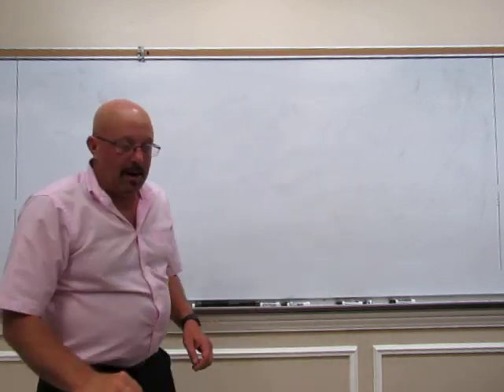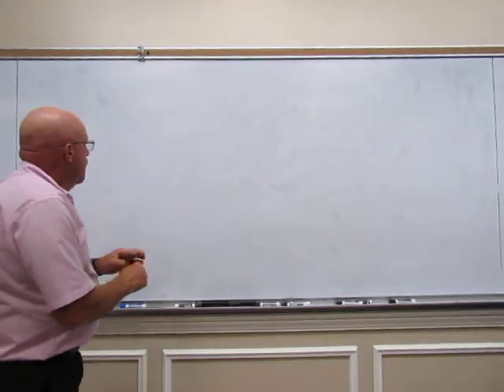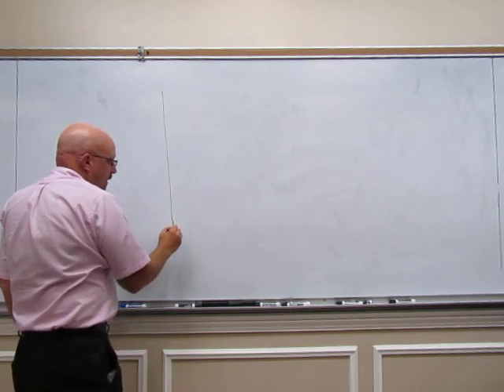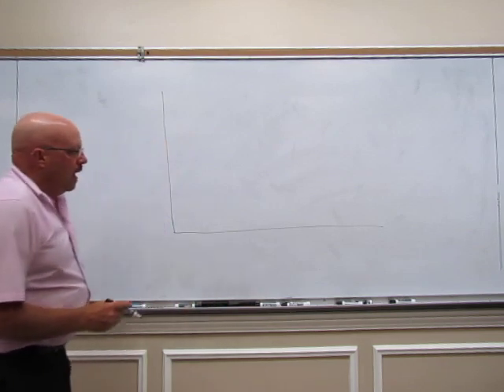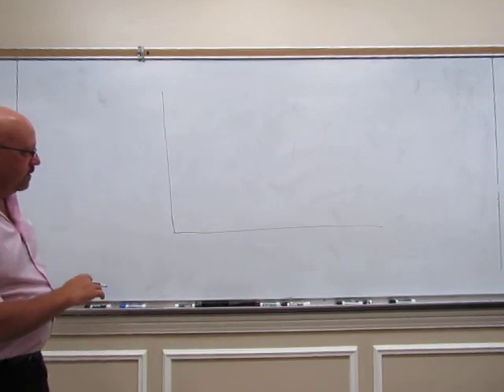Now, you want to heat at the proper rate. Well, how do you figure that out? In there, by the melting point apparatuses, there's some temperature curves.